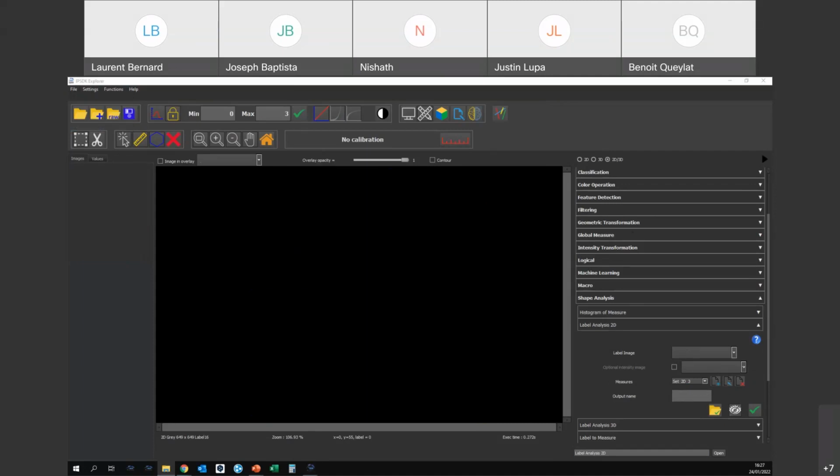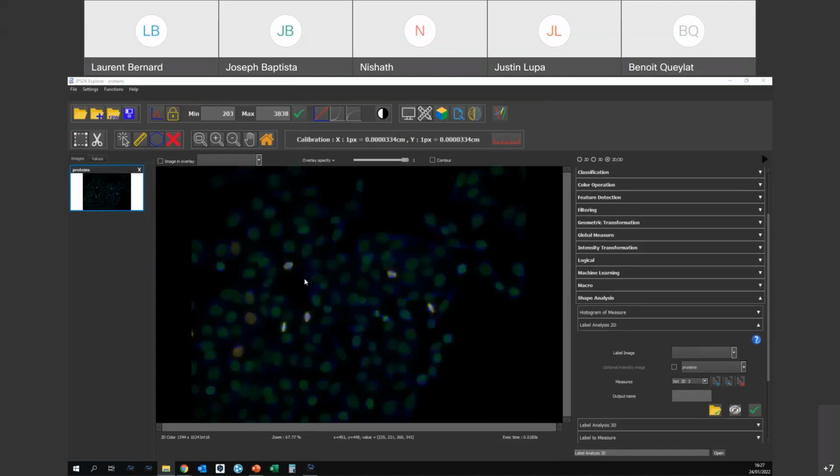Now, new feature. I will focus on an optical microscopy image, but multi-channel. Of course, it could be multispectral, it could be multi-energy. But what does it mean? As I said previously, it means a data set with different acquisitions combined and merged with different channels. If you have a look here in the value, you will see several pieces of information.